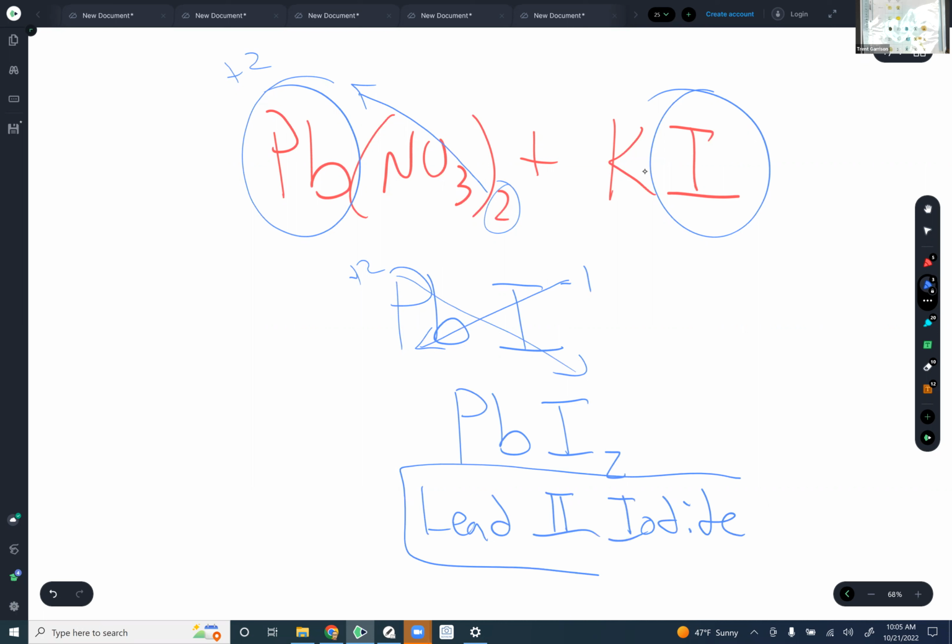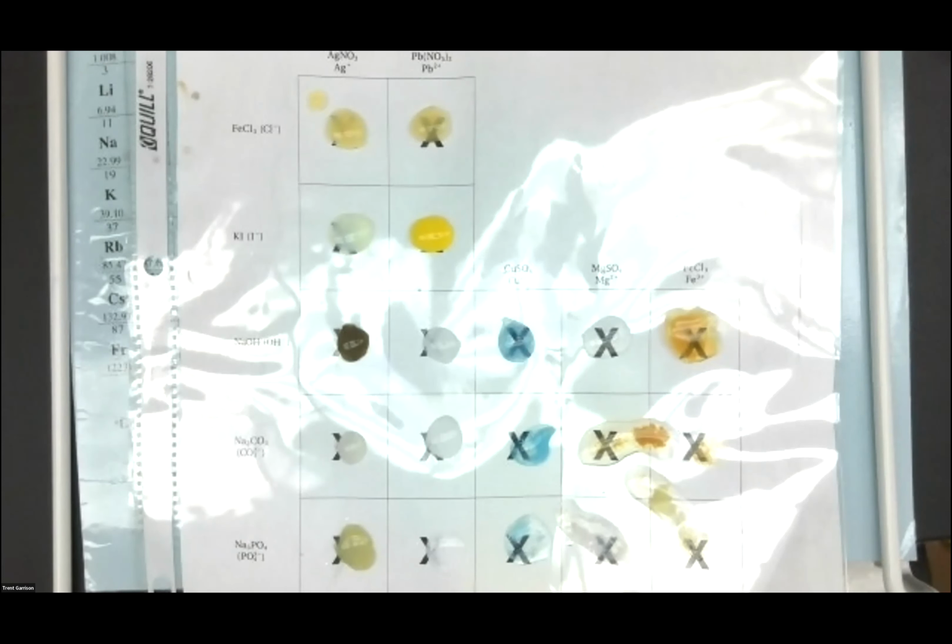And that's what I want from you, is to pick your favorite and for you to write a nice little summary of what I just did, of the compound, the color that you observed that you like the most. All right, this is everything that I wish to share with you for this little activity. It's ionic compounds. This is what we're going to practice for the next 2 weeks.